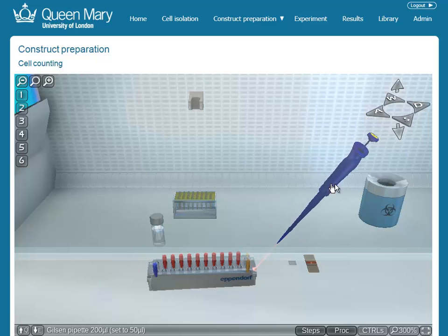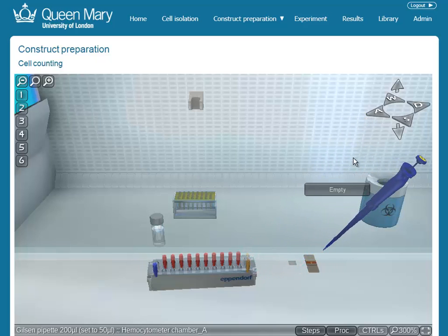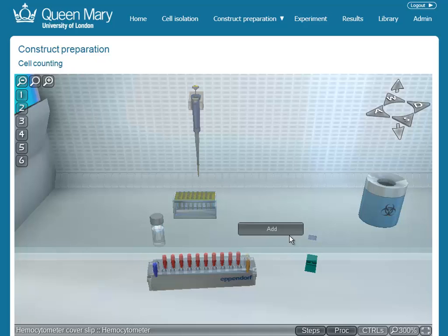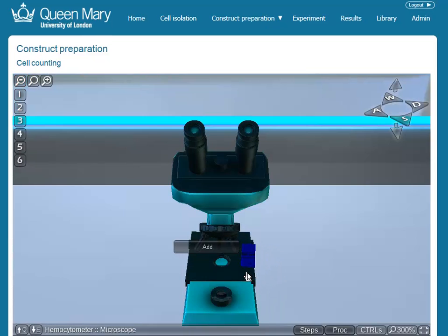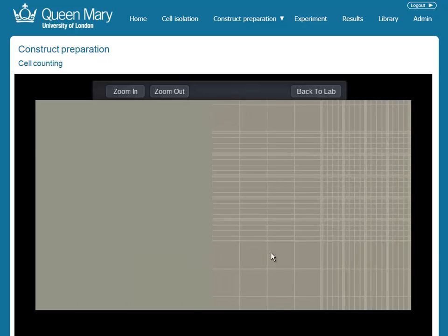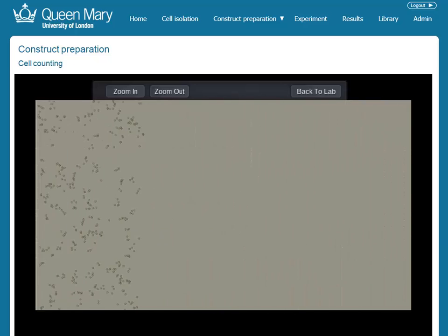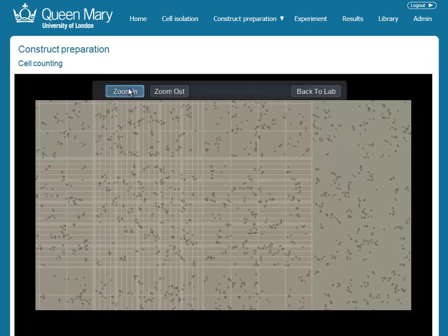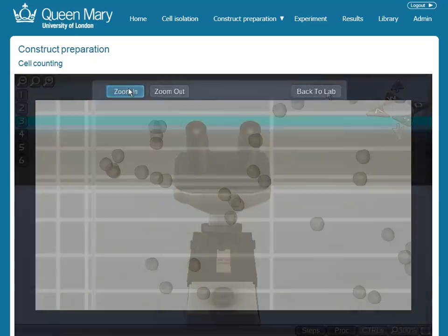This ability to make and then learn from their mistakes is one of the key benefits of using a LearnX 3D virtual lab. Here, for example, you can see that if only one chamber of a hemocytometer is filled, only that chamber has anything in it when viewed through a microscope. This may seem obvious, but trying to provide this type of flexibility with older e-learning systems and predefined animations would be prohibitively expensive.